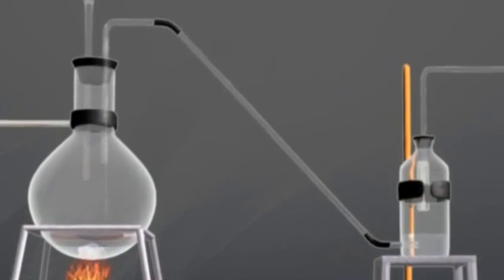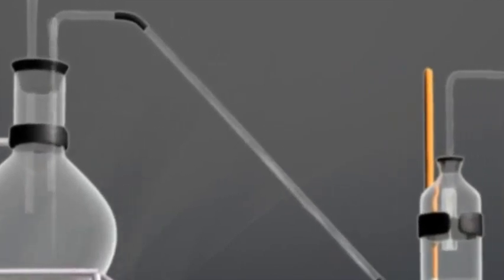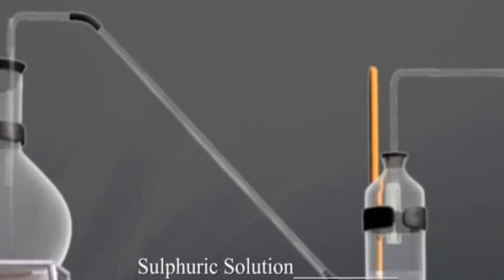When the mixture in the flask is gently heated, HCl gas is evolved. This HCl gas is again passed through sulfuric acid solution for drying.